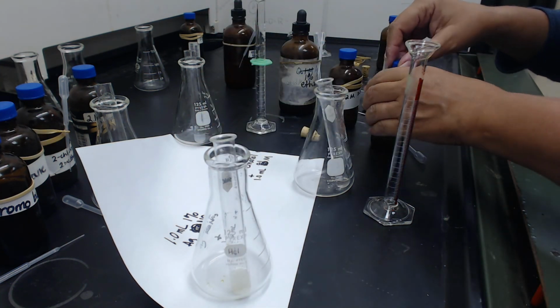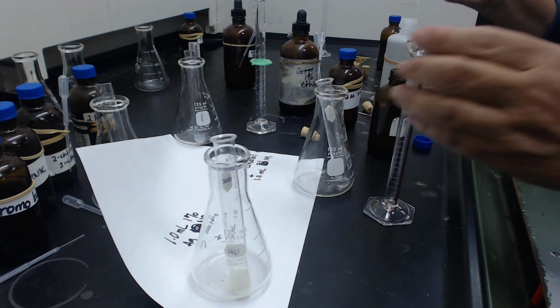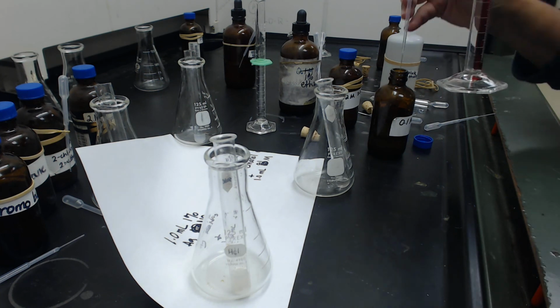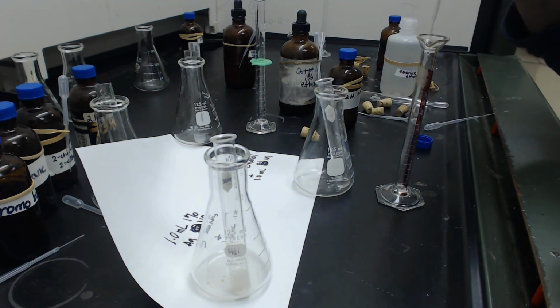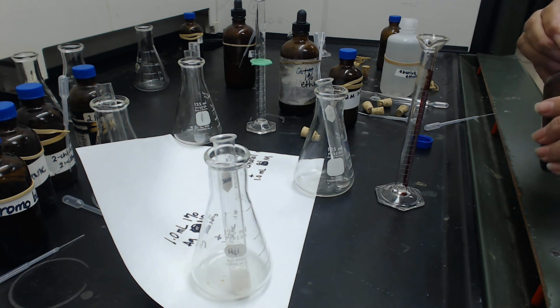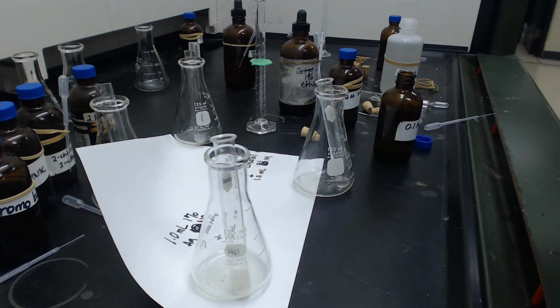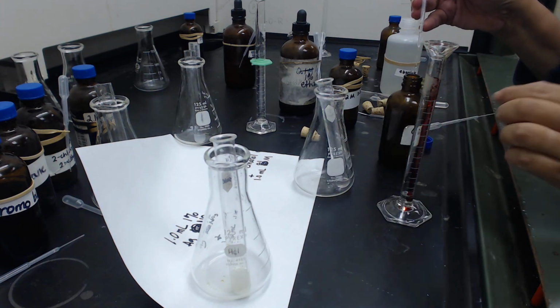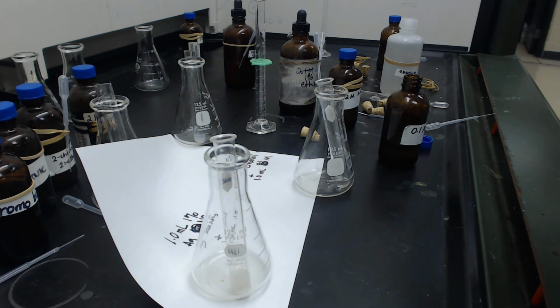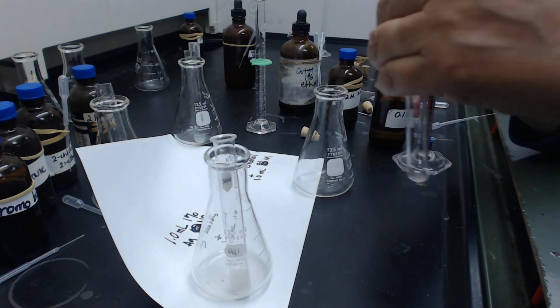Let me do the same thing with the other one. So I've got to get about a milliliter of the 0.1 molar 2-bromo-2-methylpropane. It's not coming out. It's taking me a while here. All right, let's see if that's enough. Not quite. I'm probably mumbling over here because I don't have my microphone. All right, so that's 1 milliliter.